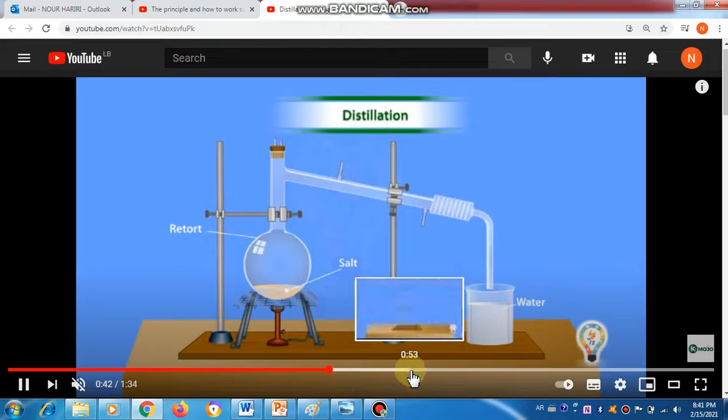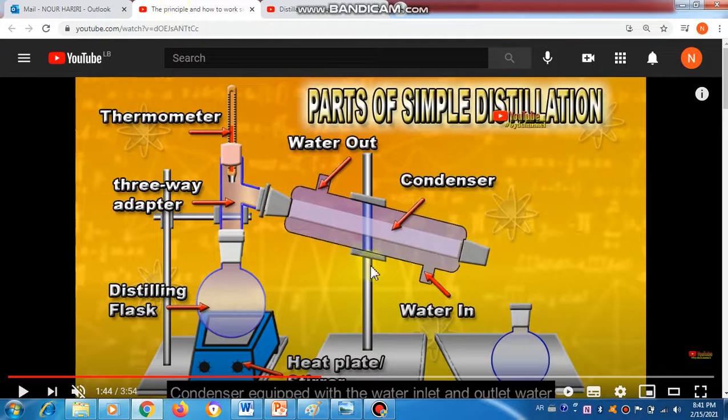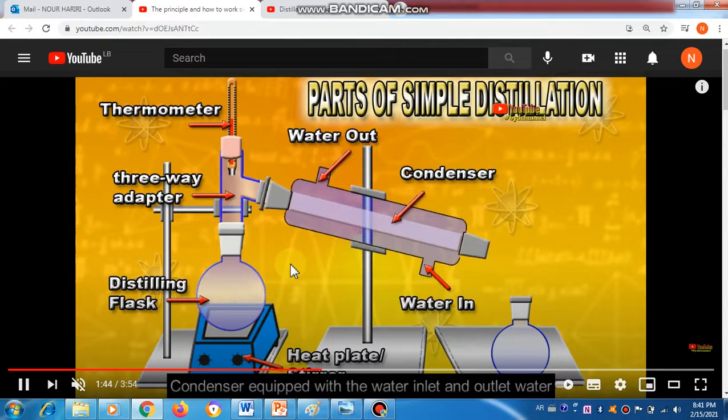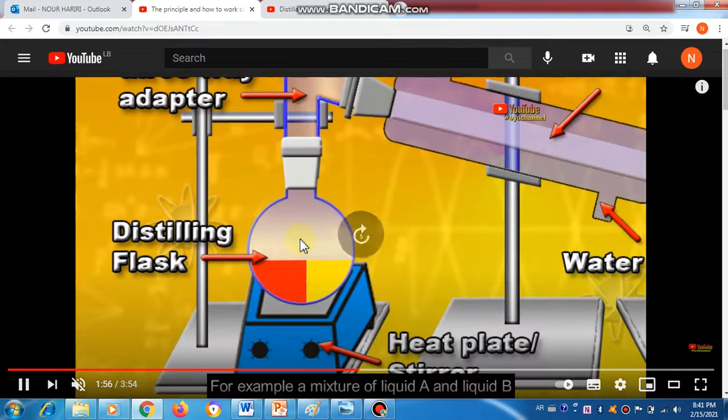هيدي أول experiment حبيت تشوفوها. طيب تاني experiment هي when we have two miscible liquids and we want to separate them. Look at this experiment. We have two liquids A and B. We are going to mix them. حتى تفرقوا بيناتهم لون لكم ال A بالأحمر وال B بالأصفر، بس both of them are liquids. A is water and B is alcohol.